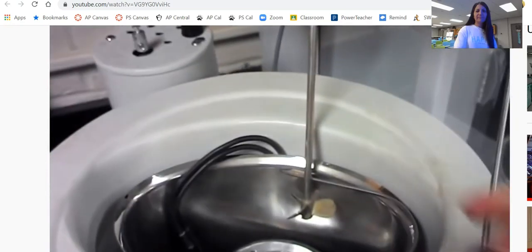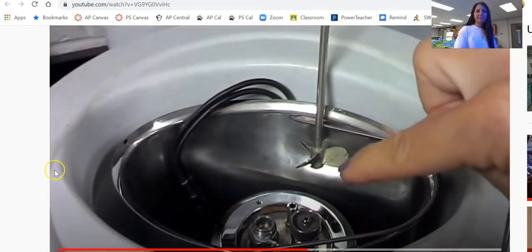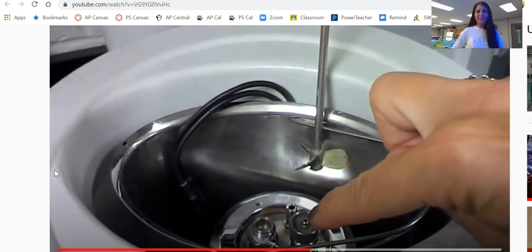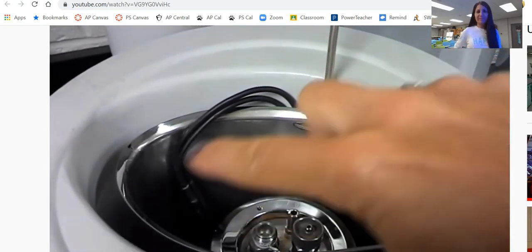The stirrer is going to stir the water that's in this big pool here. So remember what we were saying, the reaction heats the water that's surrounding it. We're still using that same idea as in a simple calorimeter, that the heat given off from the sample is going to warm the water in a uniform way.